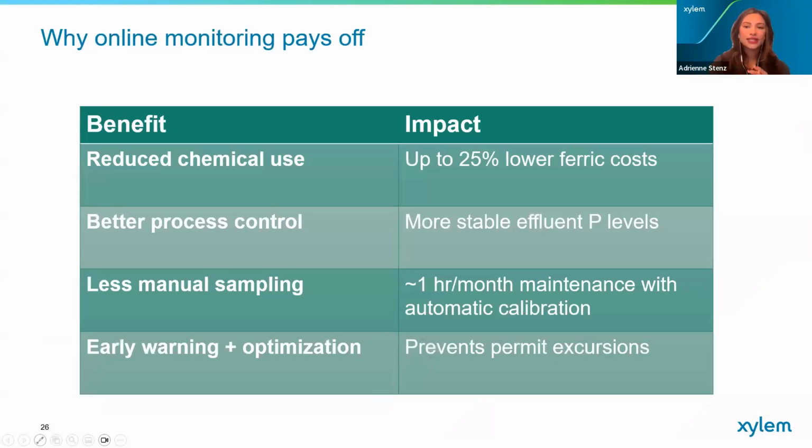Though they require maintenance, online analyzers for phosphorus often pay off when compared to grab sampling and laboratory testing. Grab samples are snapshots in time, which only give you information in that specific moment, versus online instruments give you access to data 24/7, with which you can make informed decisions immediately and not after you wait for lab results to come back.